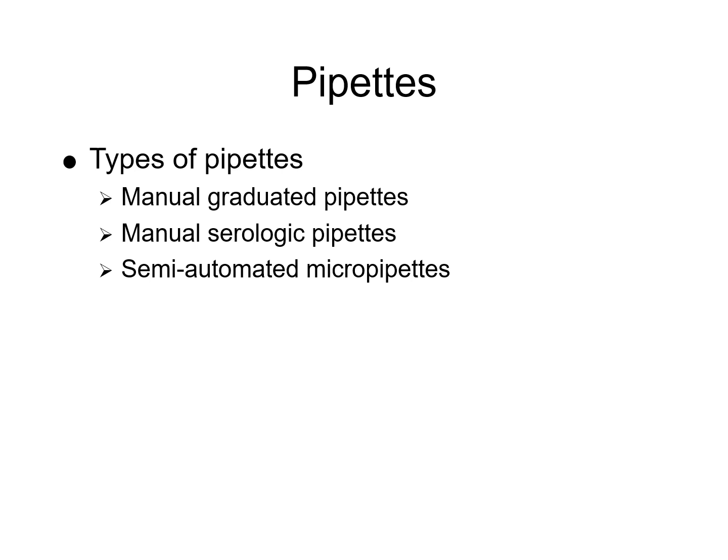The different types of pipettes that we use include the manual graduated pipette. This is a glass or plastic pipette with graduation marks for measuring variable volumes. It's used for transferring different volumes of reagents or samples and requires careful visual reading at the meniscus for accuracy.